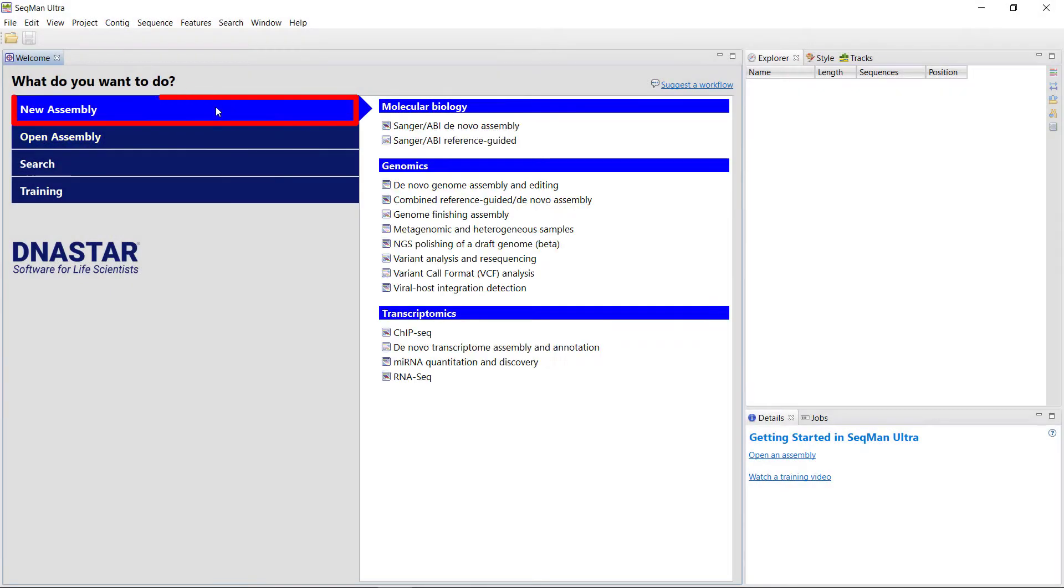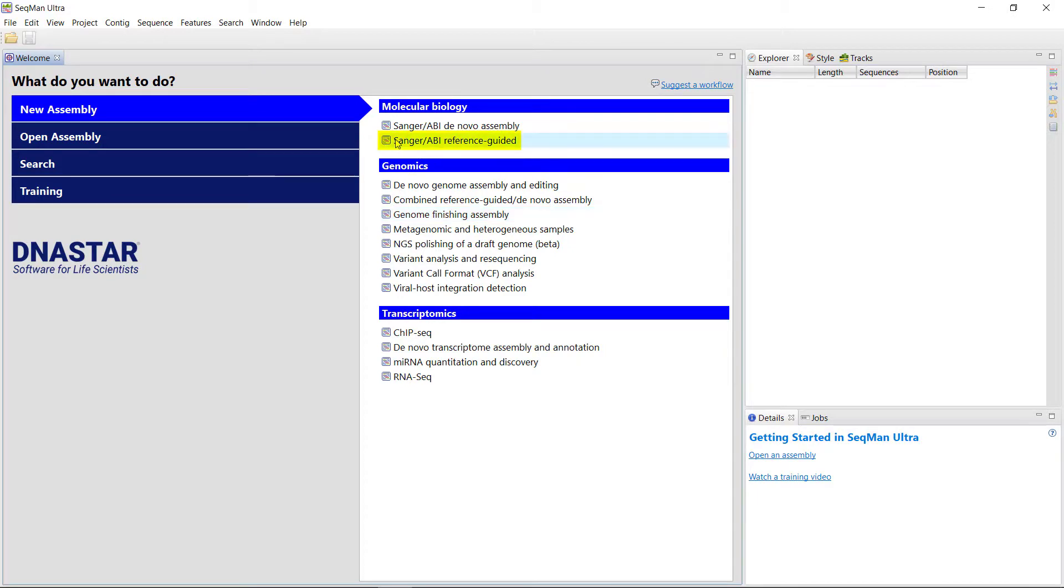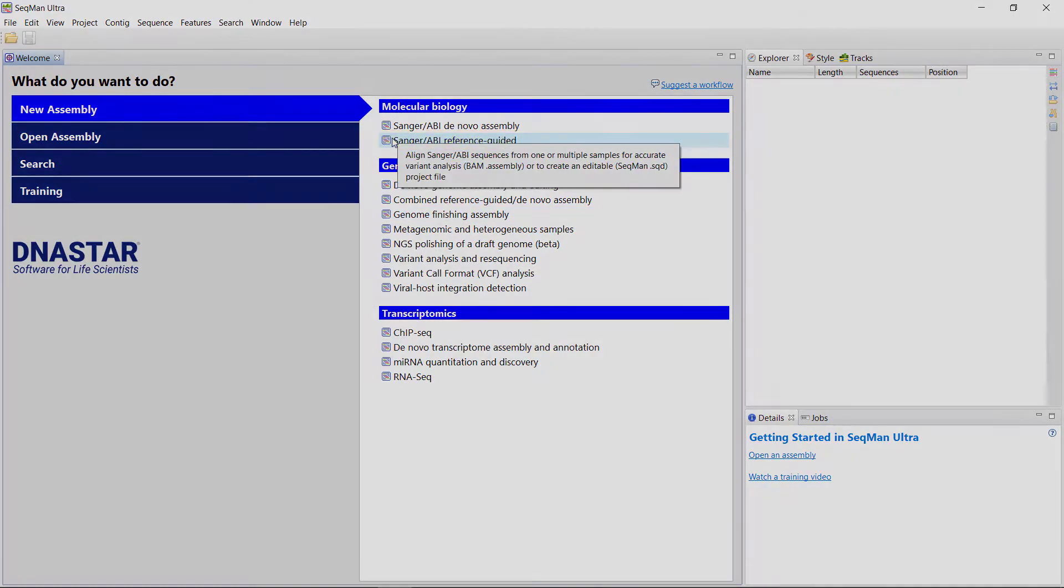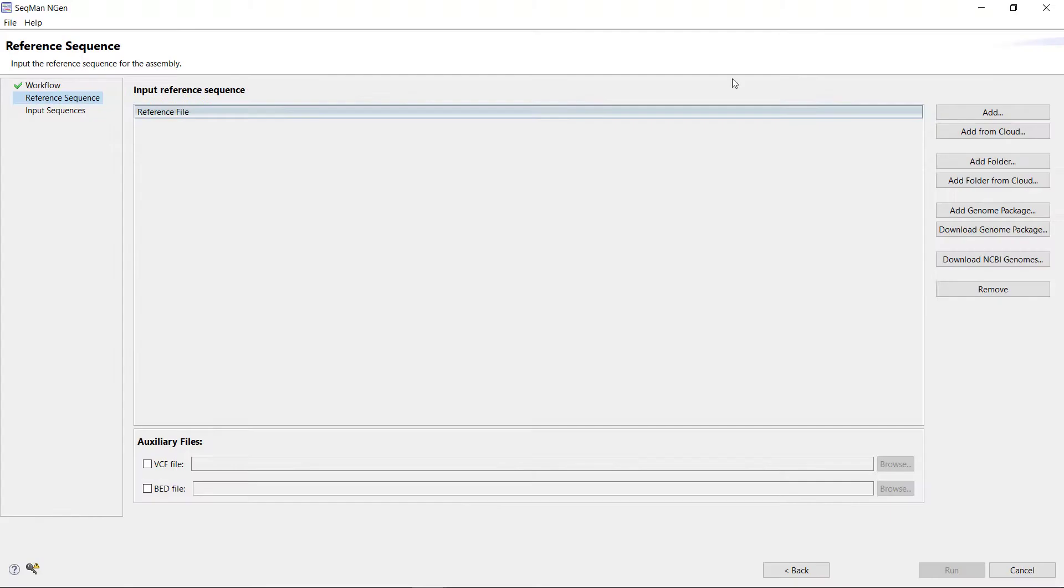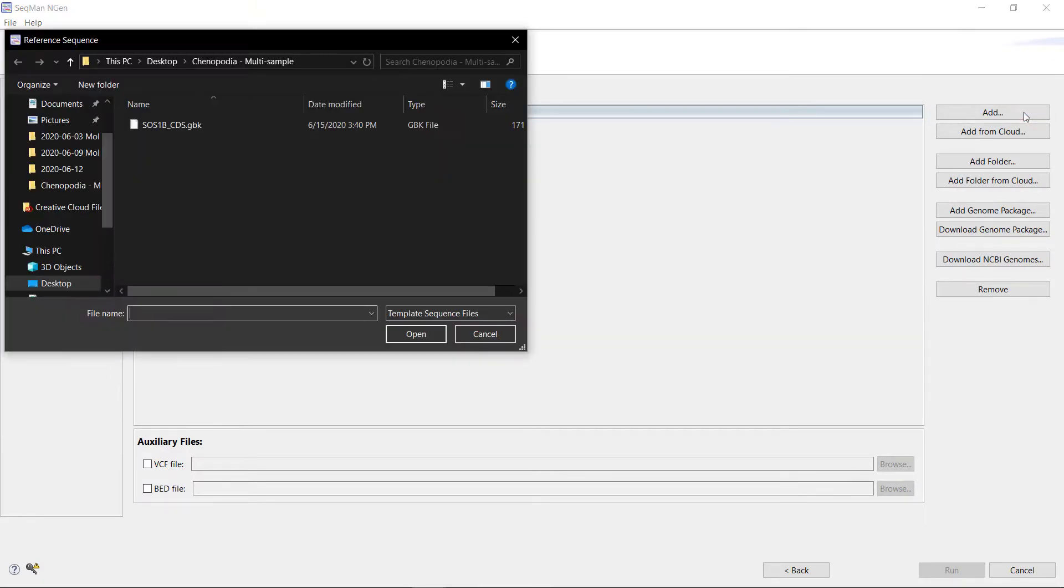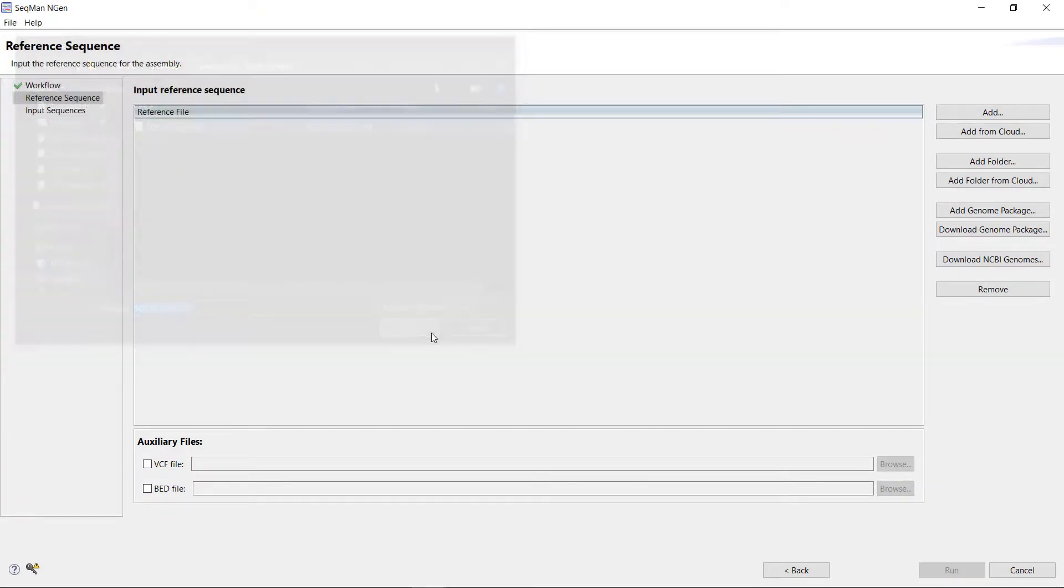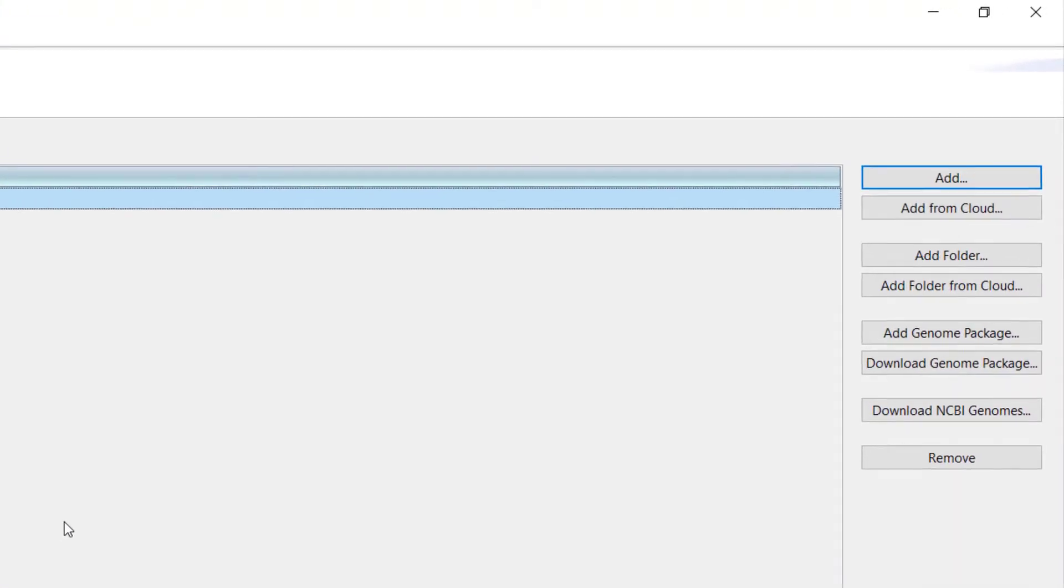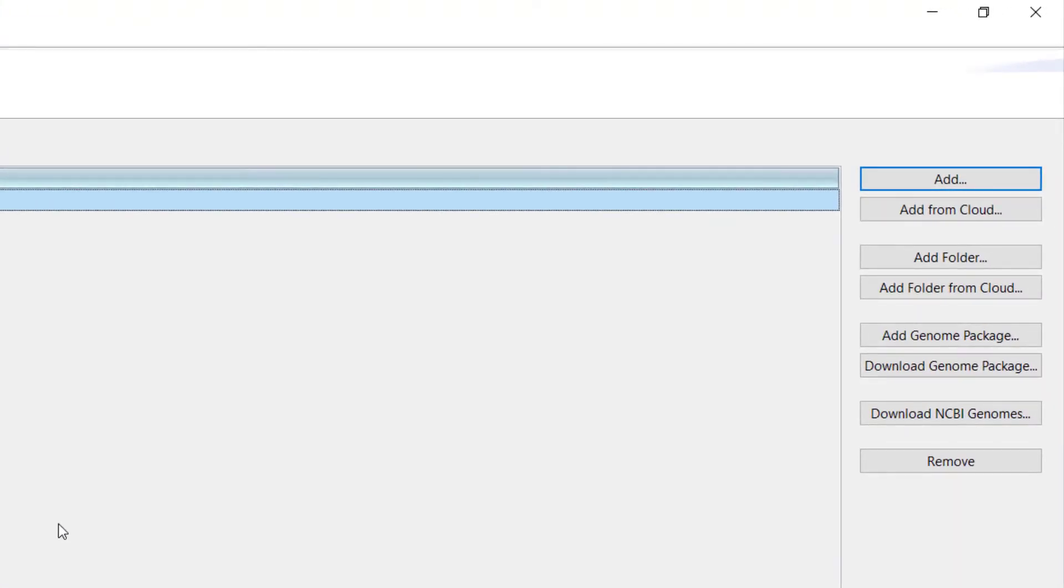I'm going to click New Assembly in the left-hand menu, then select Sanger ABI Reference Guided under Molecular Biology. In the Reference Sequence page, I'm going to add my GenBank file as a reference sequence. Note that you can import your own reference sequences as I have done, or download a reference directly from NCBI. You can also use one of our Curated Genome template packages.